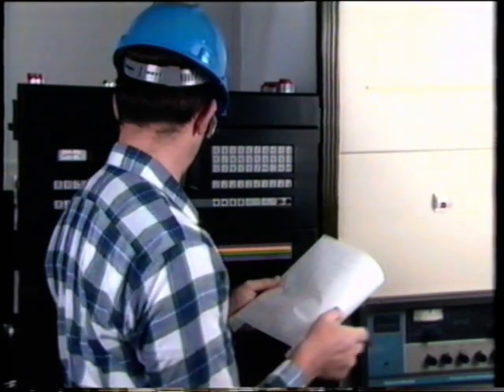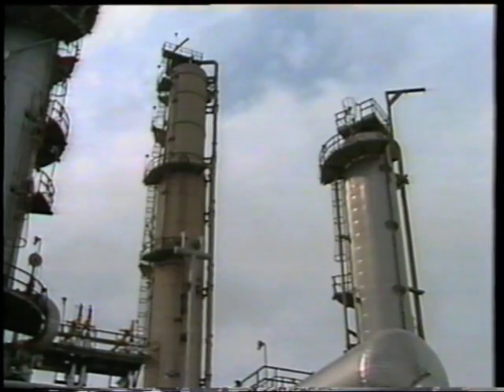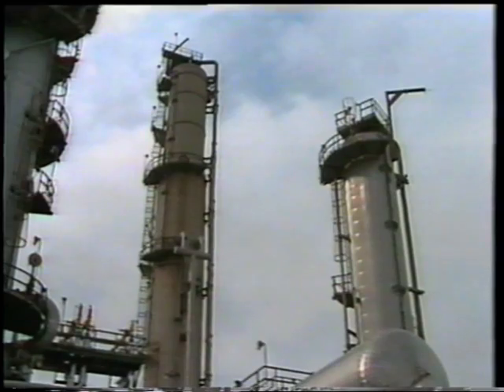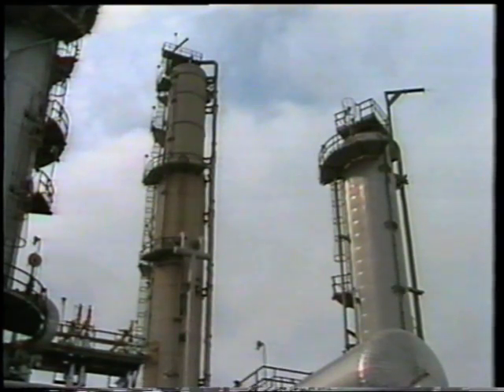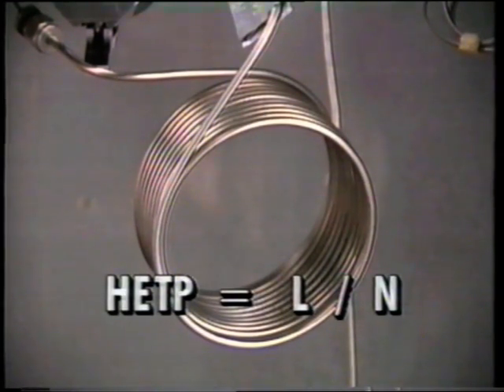The concept of theoretical plates helps express column efficiency. To understand this concept, consider a distillation column. The more trays, the better the distillation. Although a chromatographic column does not have trays or physical plates, its number of theoretical plates is a measure of its efficiency of separation. Column efficiency is a function of HETP, or height equivalent theoretical plates.